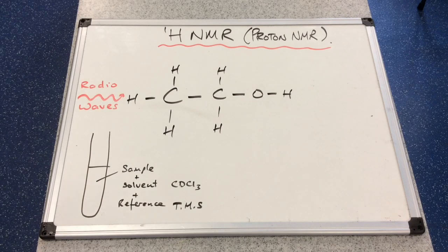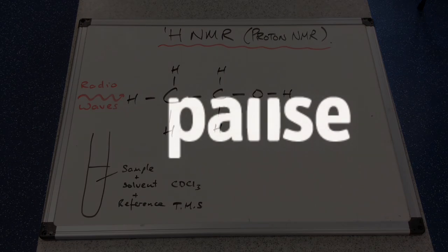So if we think about ethanol, the protons, or the hydrogens in ethanol, first of all we need to think, well, how many different environments have we got for our protons? So have a think about that, pause the video and then I'll continue.